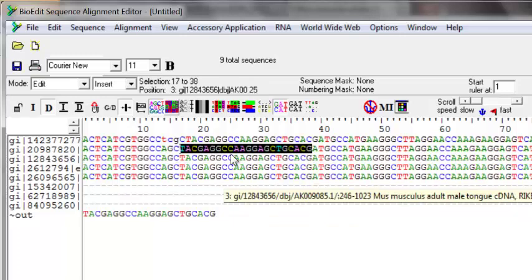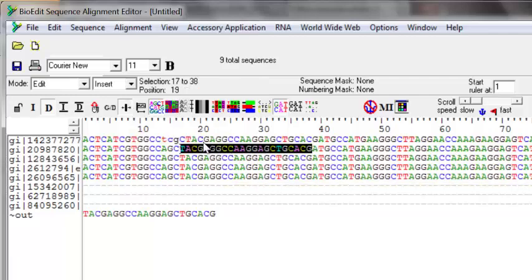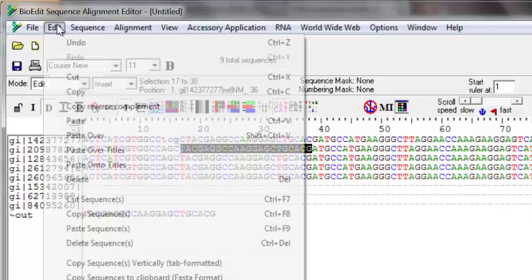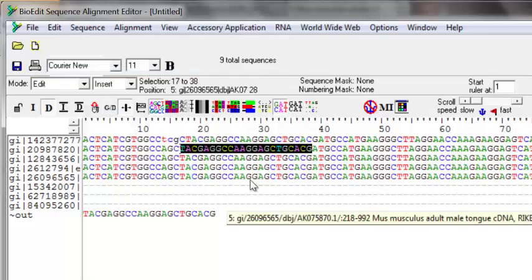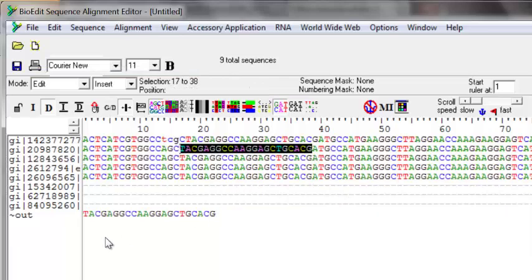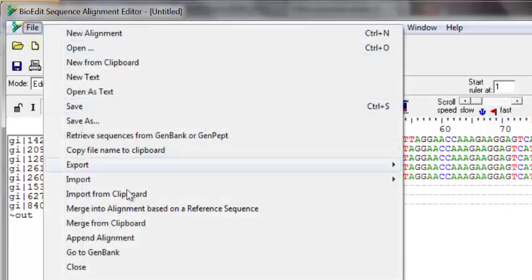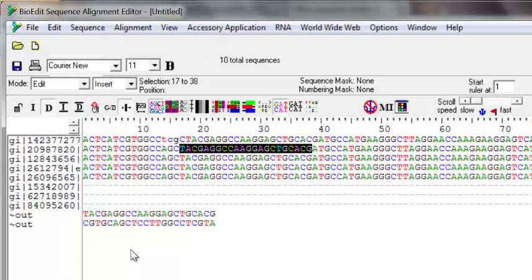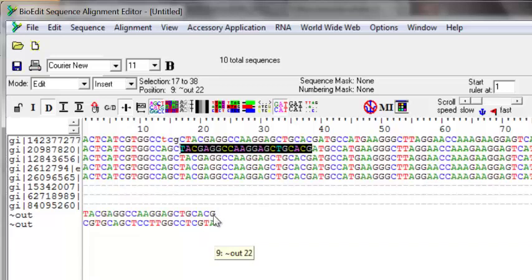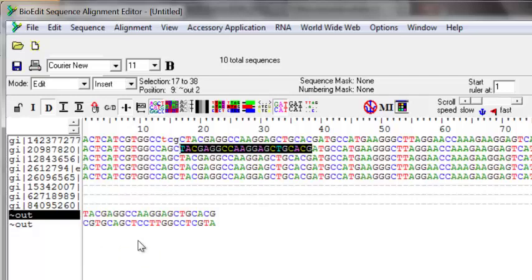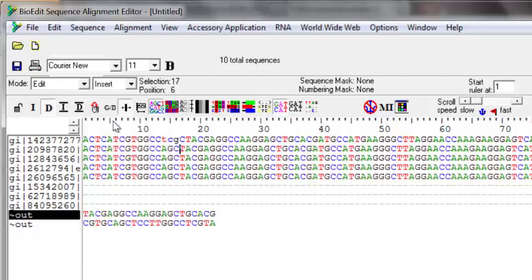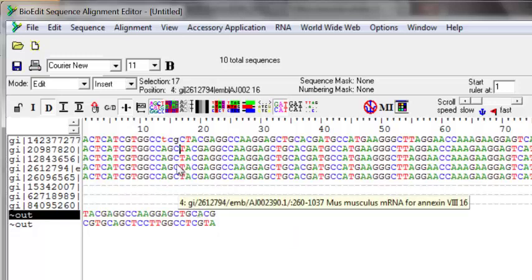When you want to design a reverse primer, you need the reverse complement of the sequence. Select the area, go to Edit, and use 'Copy Reverse Complement'. It copies the area, reverse complements it, and puts it in the clipboard. Importing it from the clipboard shows the reverse complement — for example, if the original sequence ends with G-C-A, the reverse complement starts with C-G-T. The lower sequence is exactly the reverse complement of the upper one.